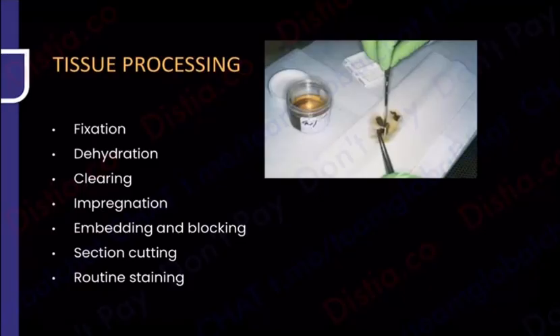So you have to start with a process called fixation. I'll give you an example. For example, we are doing a skin biopsy. Okay, let's consider I'm doing a skin biopsy. So whatever I have taken from the skin, what is the fluid that I'm going to put it inside? That is fixation. Like we did a skin biopsy and I'm putting it inside a fluid.